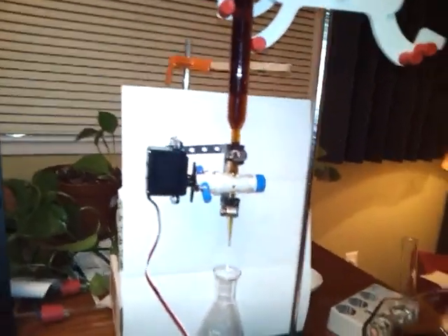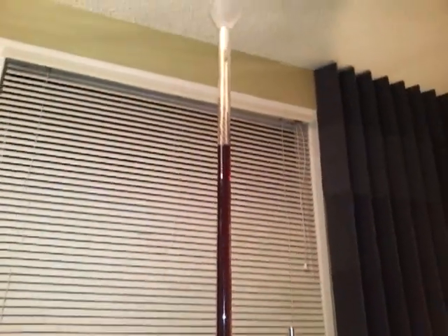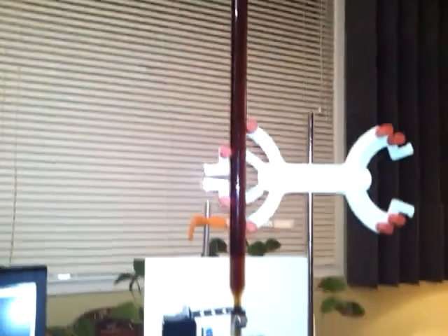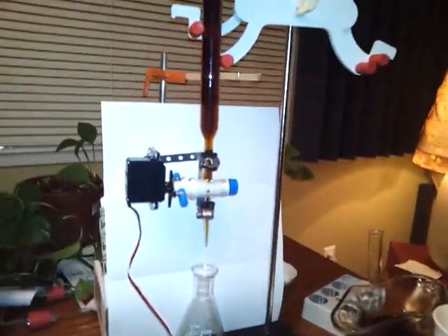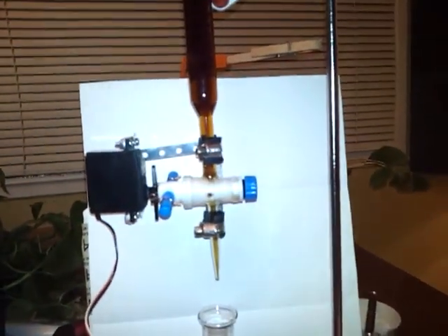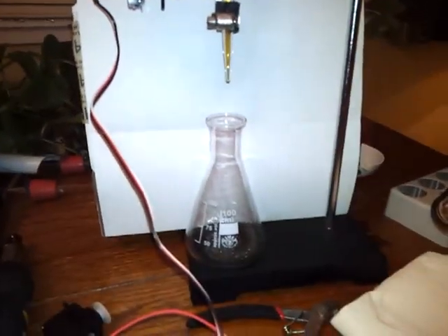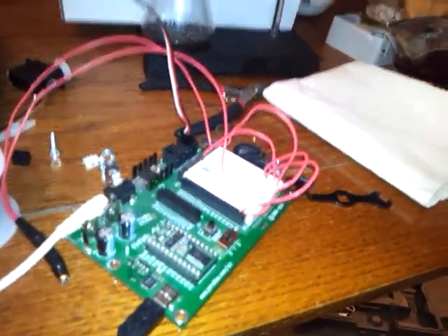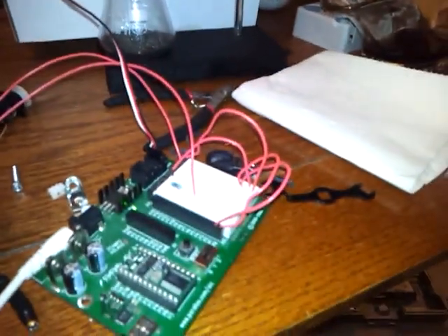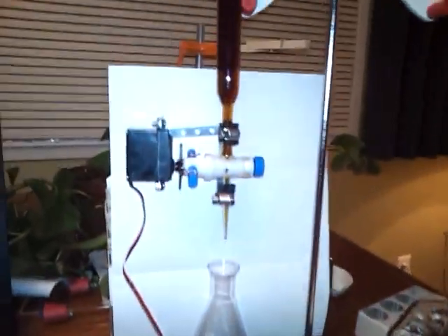This is my programmatic small volume liquid dispenser. We have a burette filled with about 75 milliliters of watered-down vinegar, and a servo connected to the stopcock on the burette. The servo is connected to the microcontroller which has the program to control the servo, so when I hit this button to reset the program it runs.